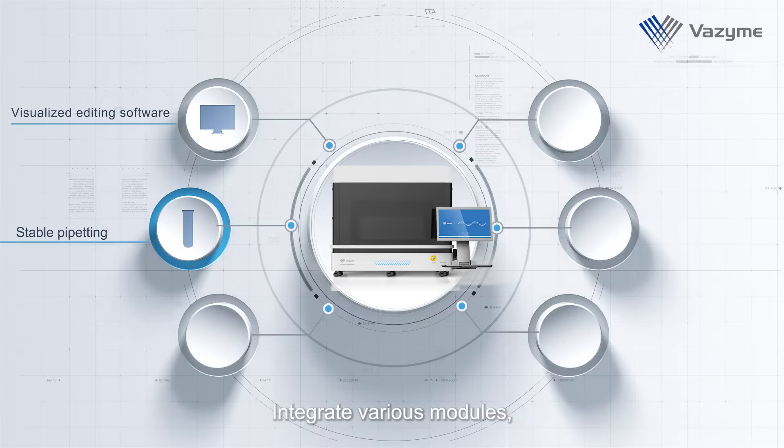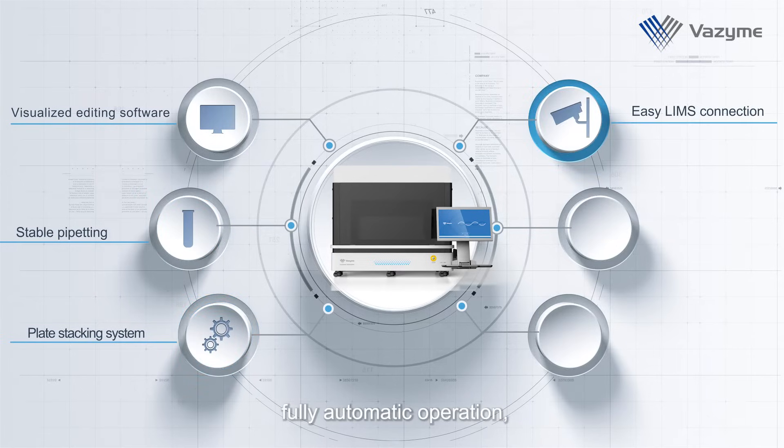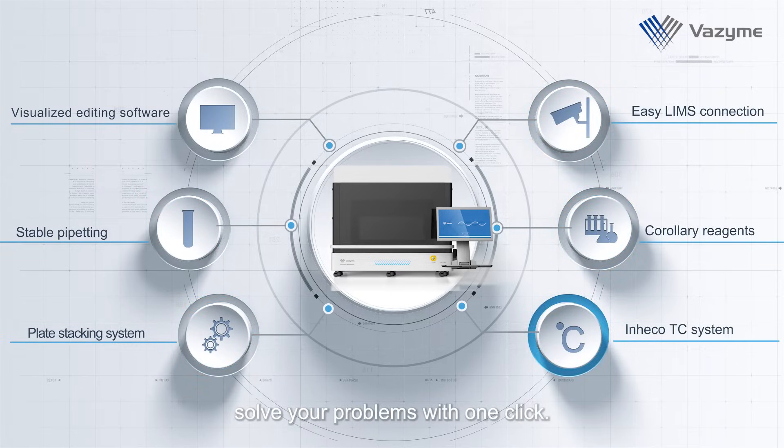Integrate various modules. Fully automatic operation. Solve your problems with one click.